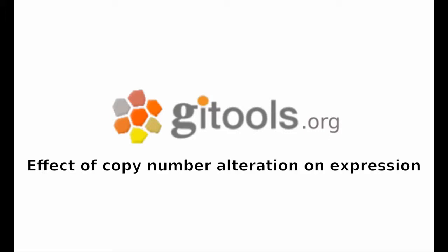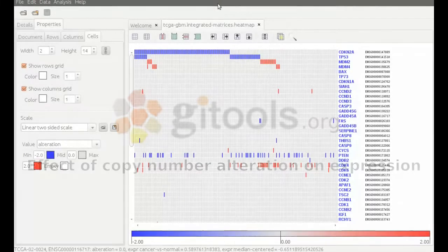In this video we will show you how you can verify if the copy number alteration has an effect on the expression of the gene in question.